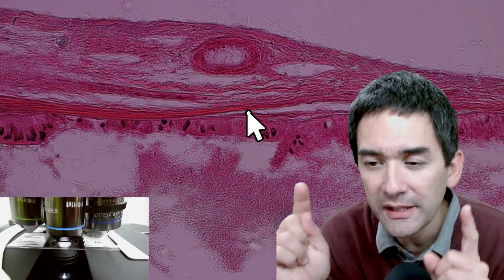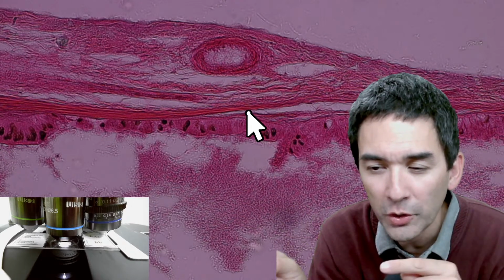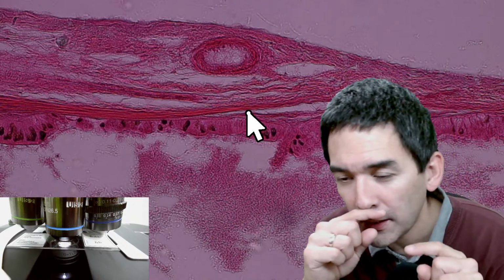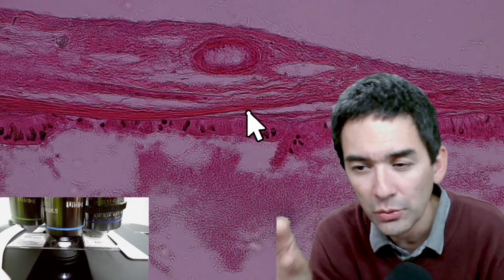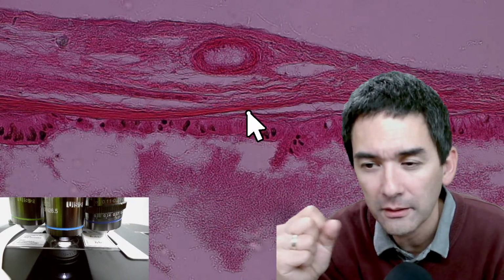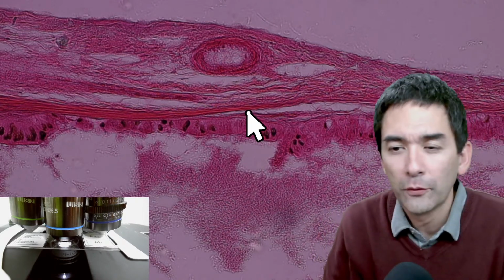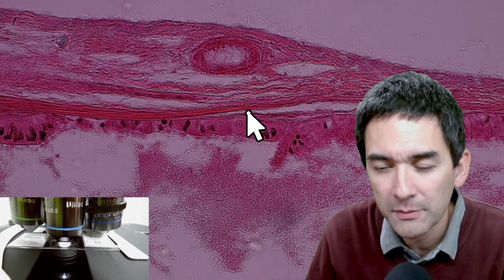It is formaldehyde or formalin. One of those two is dangerous. The other one is used commonly in preserving. I don't know which one. One is highly cancer causing and is not allowed. Either it's formalin or formaldehyde. You use the not so dangerous one, obviously. It smells pretty badly anyway. I forgot which one is used, but one of them is pretty dangerous.